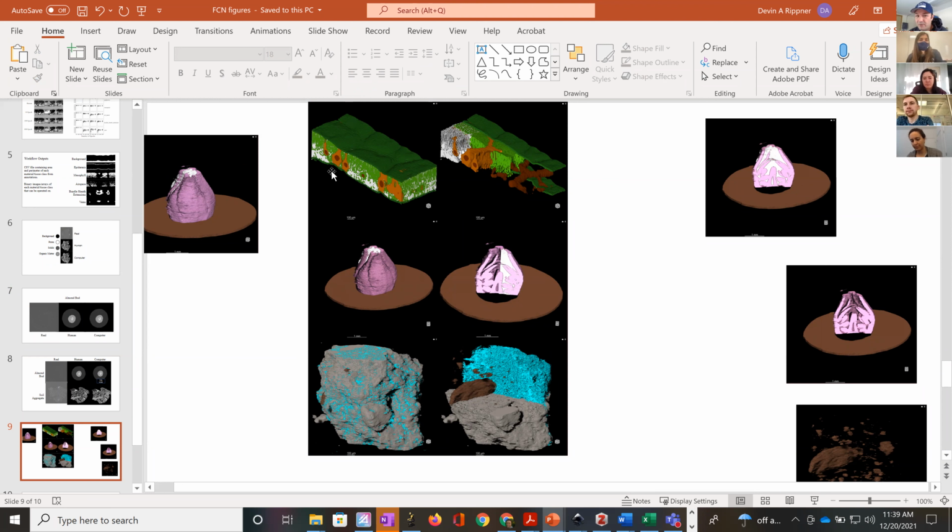So here's some of Amina's leaves. This is the generalized prediction. It does a pretty good job of finding the veins and bundle sheath extensions. It works for our flower tissues and it works for our soil aggregates.